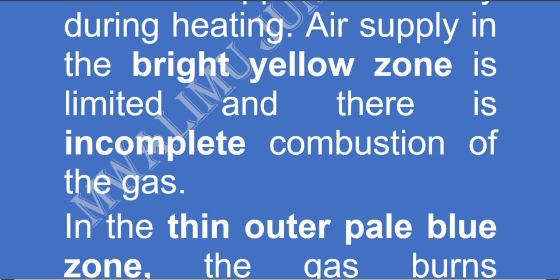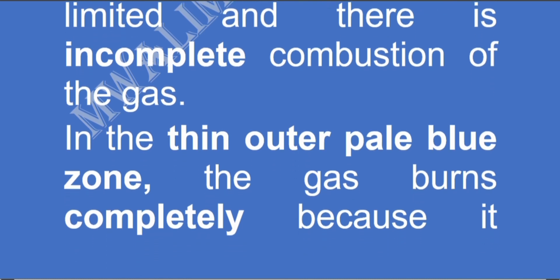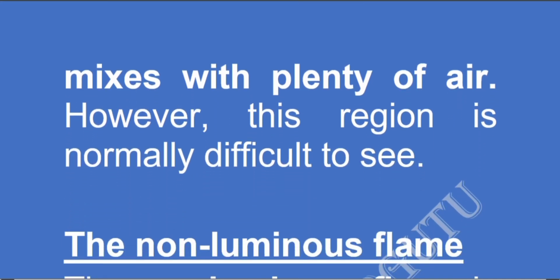Now in the thin outer pale blue zone, the gas burns completely because it mixes with plenty of air. However, this is normally difficult to see.